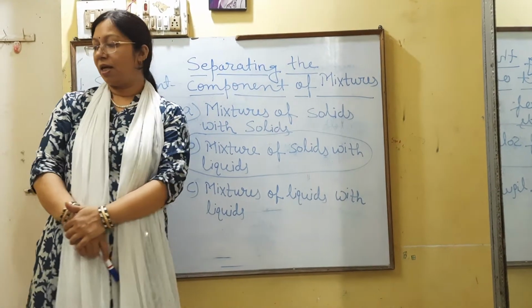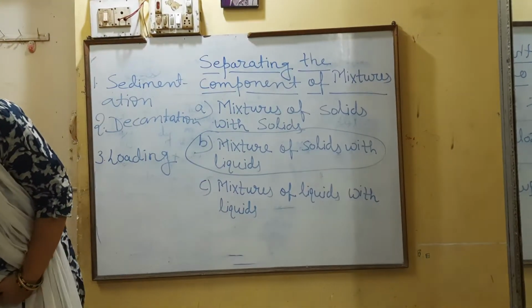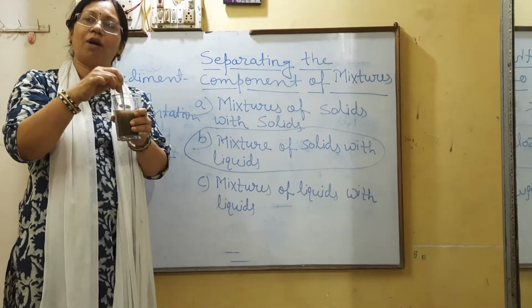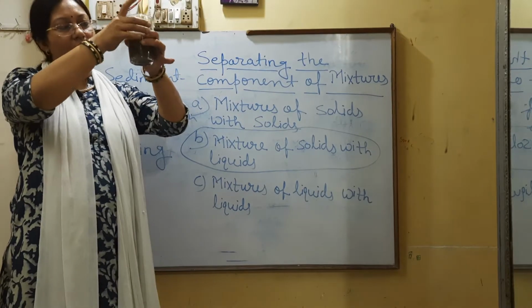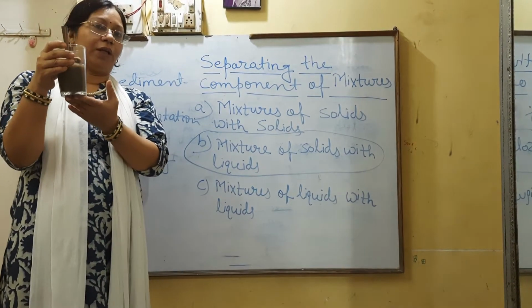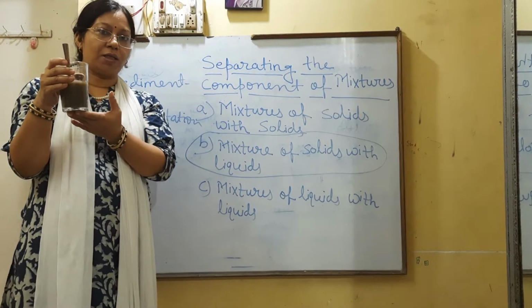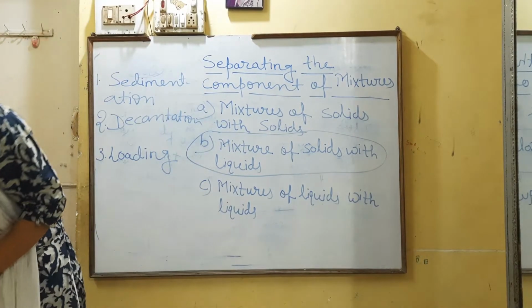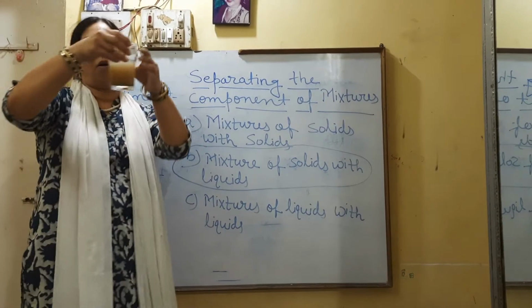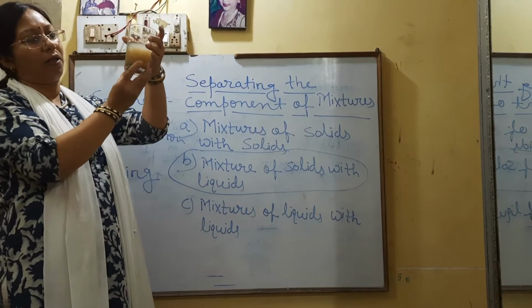For that I brought some soil particles and mixed them with water. You can see the muddy water, all of you are watching. If I keep it for 5 minutes, you can easily see different layers of water and mud particles.